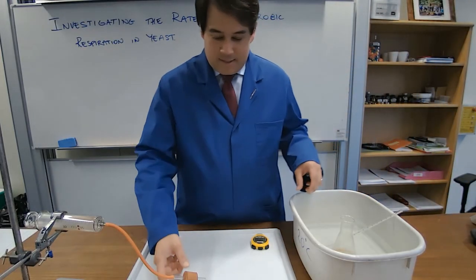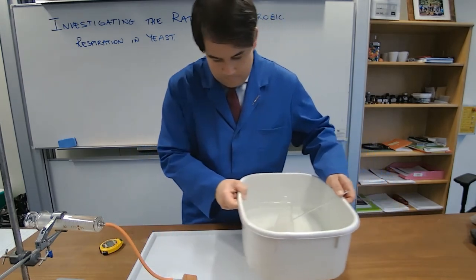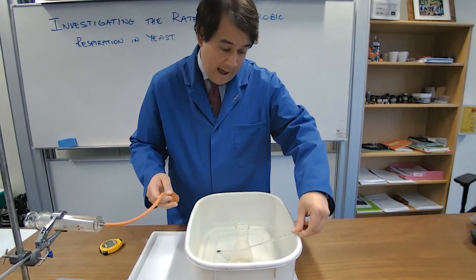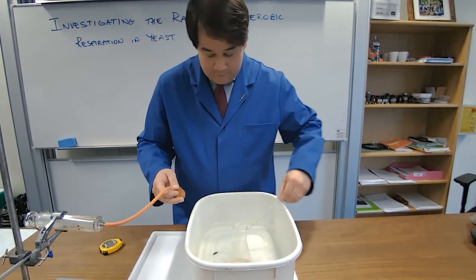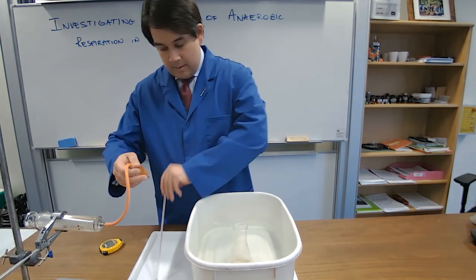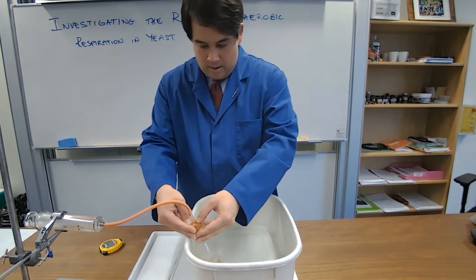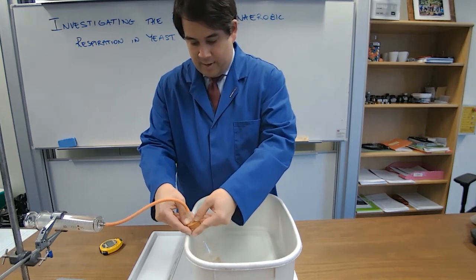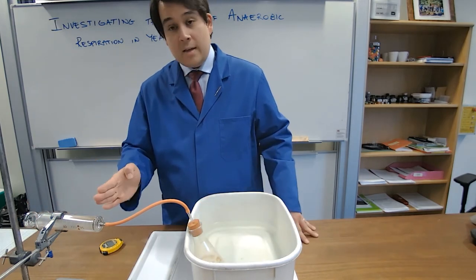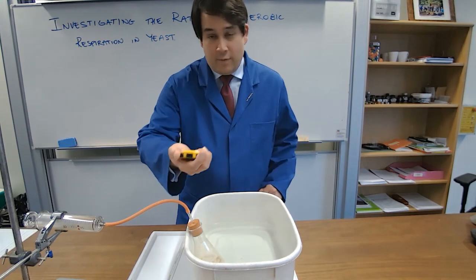Fifteen minutes have passed. So, I'm now going to bring this over. This is my measurement at 35 degrees. The water bath has remained at 35. I'm now going to put this through. And then as the carbon dioxide comes through, we should then get movement in the gas syringe. Don't forget to start the timing, obviously.